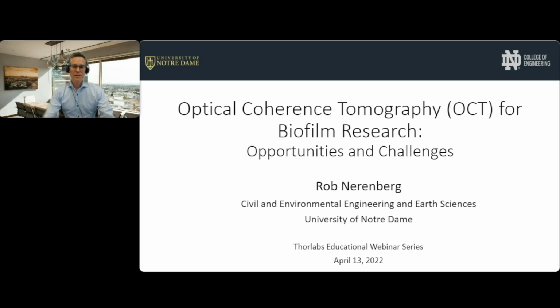Today we will discuss another very interesting application, which is the use of optical coherence tomography for biofilm research. And it is an honor for me to introduce our speaker, Dr. Robert Nerenberg from Notre Dame University in the United States. Dr. Nerenberg is a professor in civil and environmental engineering and earth sciences at the University of Notre Dame, and his research primarily centers on microbial biofilms for environmental applications.